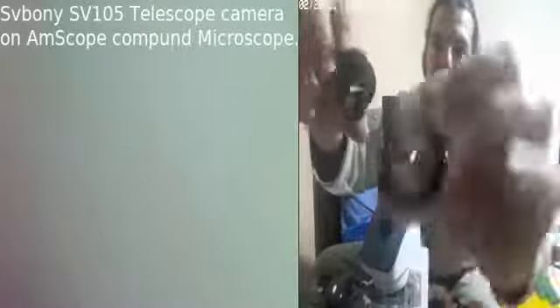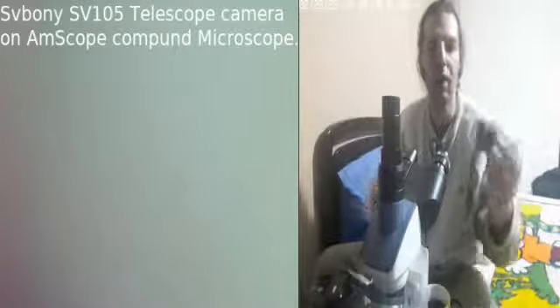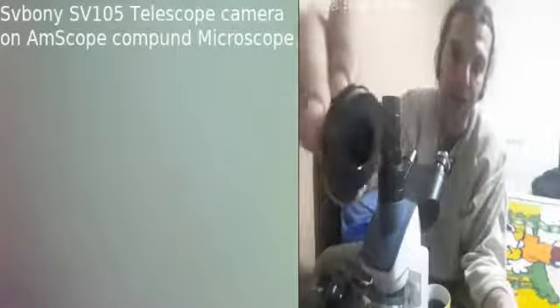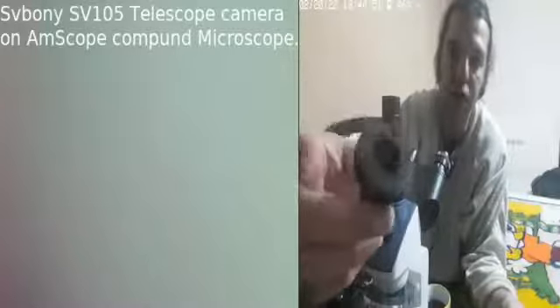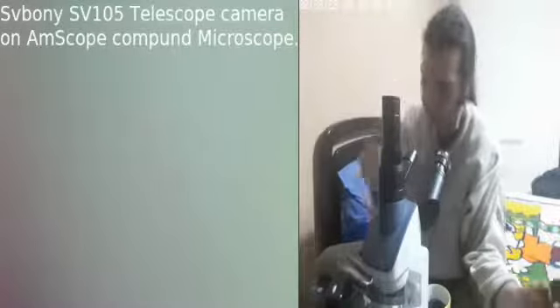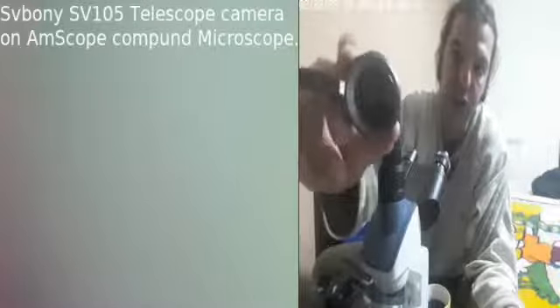For telescopes the sizes used are 1.25 inch, 0.965 inch, and 2 inch. So those are the telescope sizes. The interface here must be M42, so this T adapter is used with a DSLR camera. You need an additional ring — together with the T adapter and ring you connect to a Nikon or Canon camera.